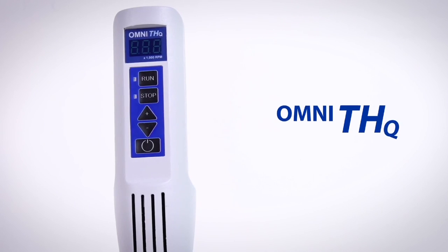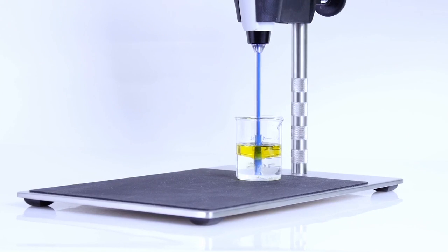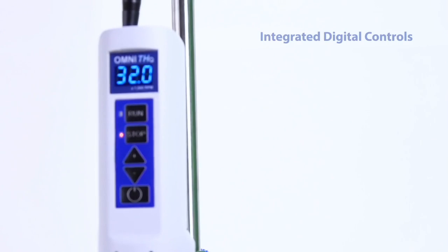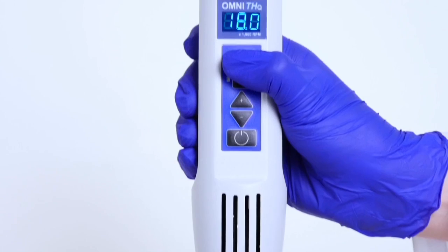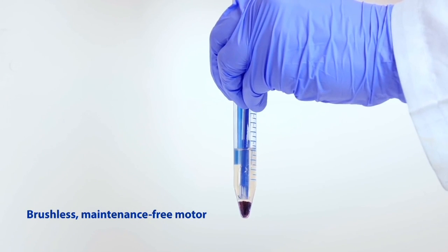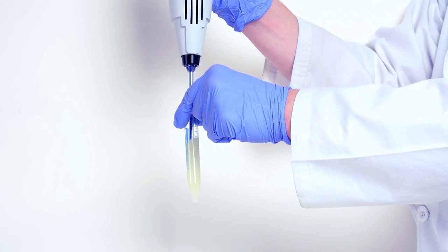The Omni THQ digital tissue homogenizer ensures ultimate repeatability for standardized applications within the lab. The integrated digital controls provide accurate results for each cycle, and the brushless, maintenance-free motor incorporates constant speed feedback, enabling it to maintain set speed throughout sample processing.